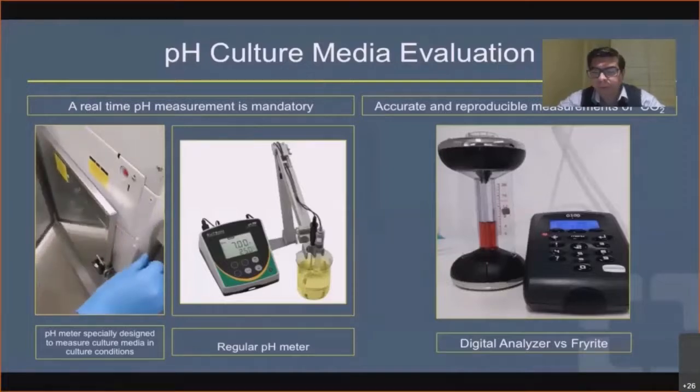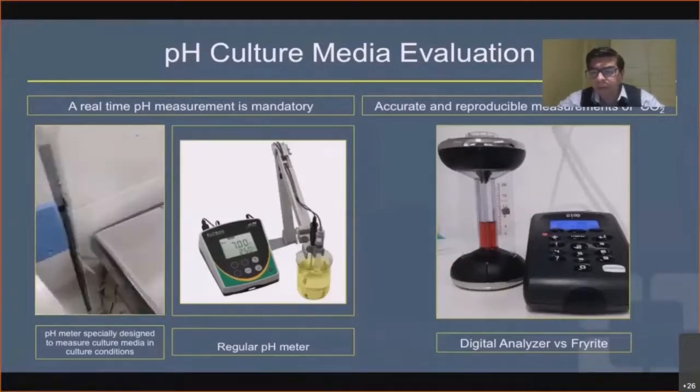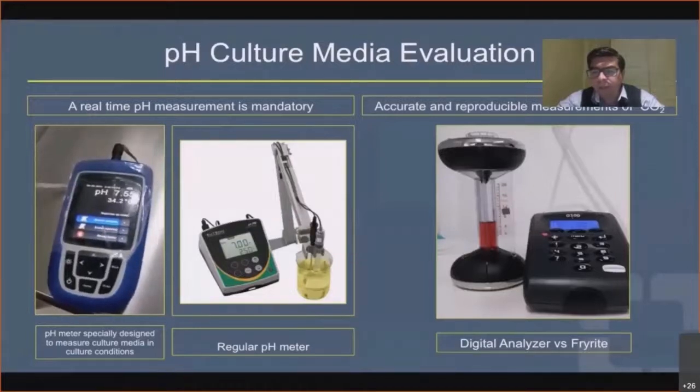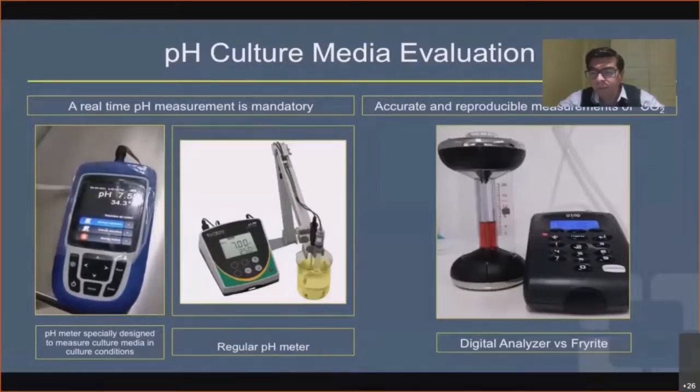Apart from this measurement of the CO2 levels, it is important to avoid as much as possible drastic culture medium evaporation and changes in the temperature of the culture media, to maintain the pH of the culture media in optimal ranges.